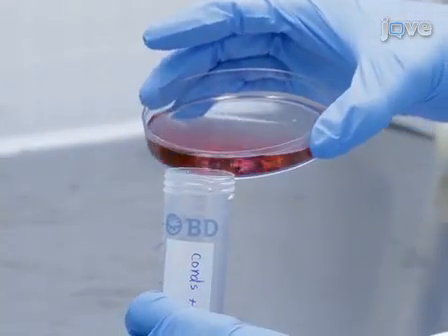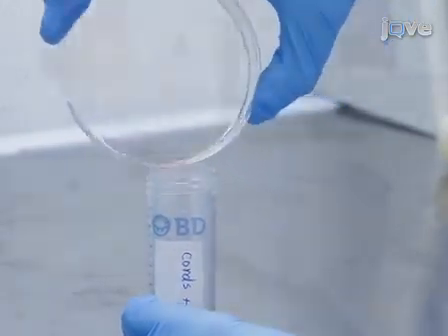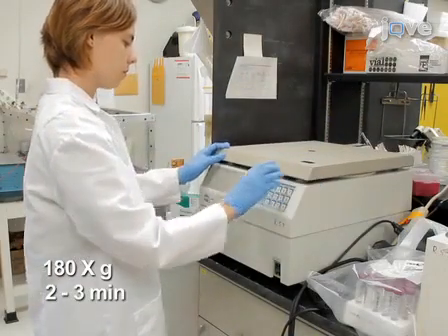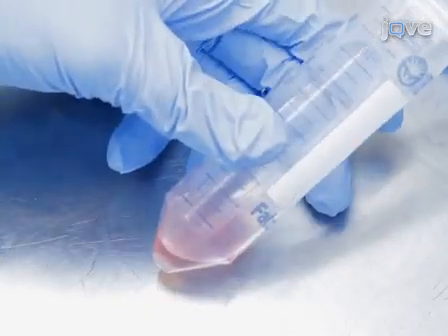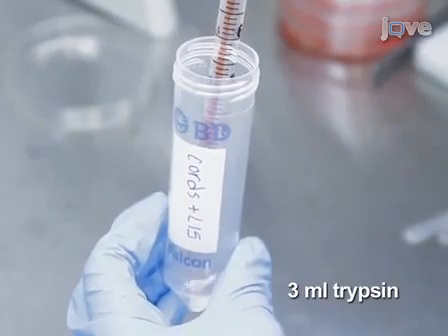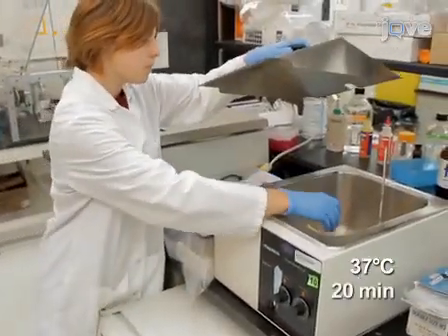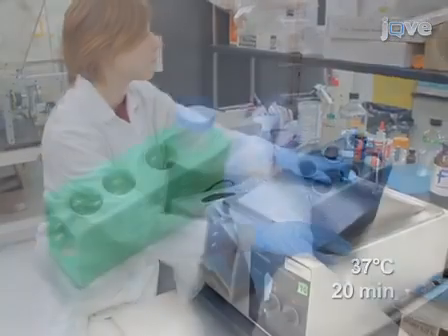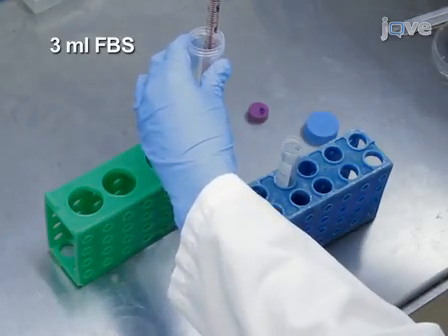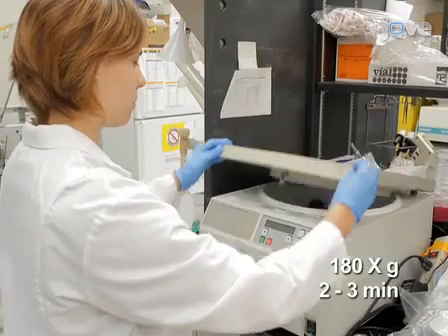To obtain motor neuron cultures, pour the chopped spinal cords and L15 into a conical tube and spin it at 180 times gravity for 2 to 3 minutes to pellet the pieces. Remove the supernatant and add 3 ml of trypsin to the pelleted cords. Place the tube in a 37°C water bath and incubate it for 20 minutes. Following the incubation, add 3 ml of FBS to the conical tube. Then, spin at 180 times gravity for 2 to 3 minutes to repellet.